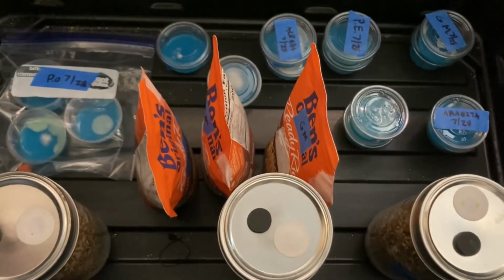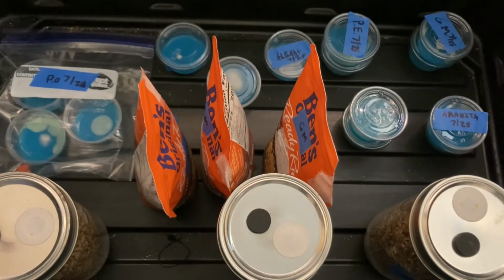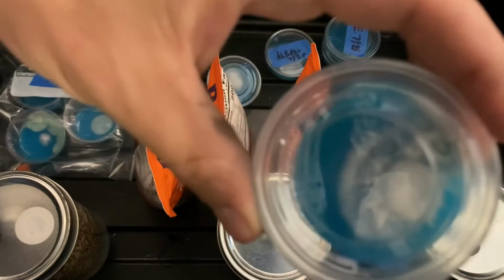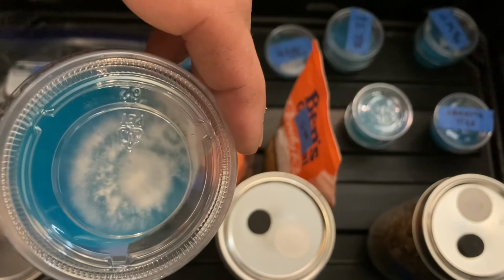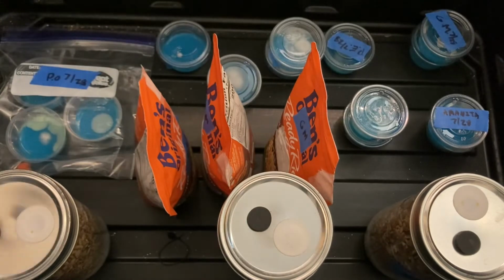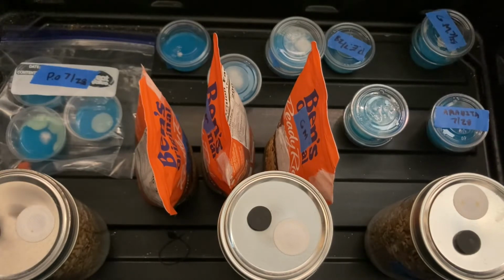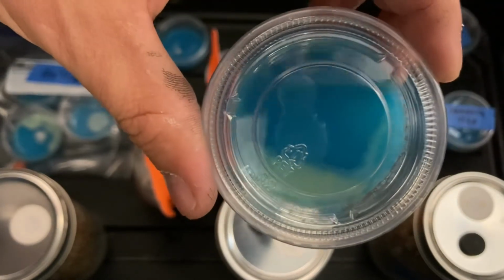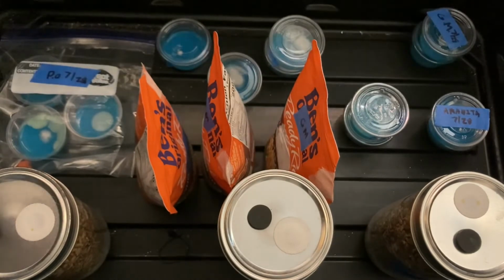And we have a bunch of others going on in here. So this one has some really good rhizomorphic growth in there as well. That's a different strain though. This strain specifically, I haven't had any luck. It looks like it's green in there to me. So I keep getting trichoderma with that specific strain.